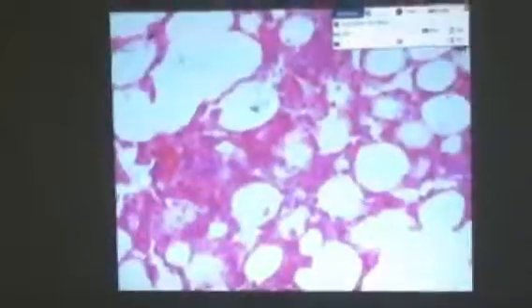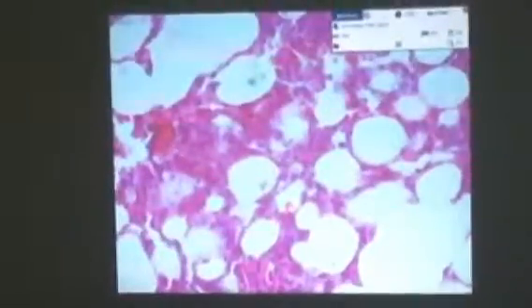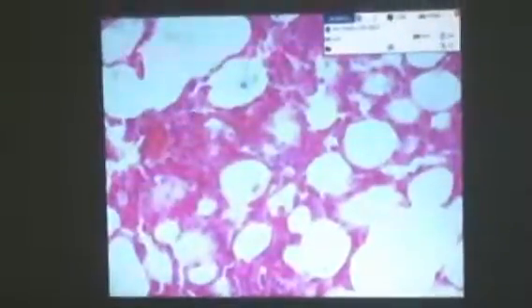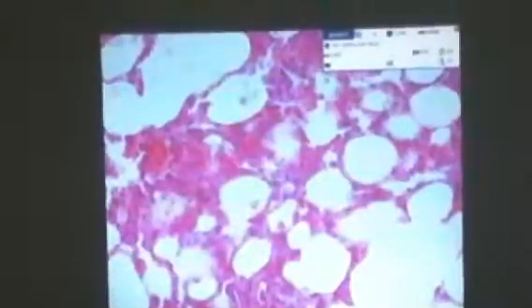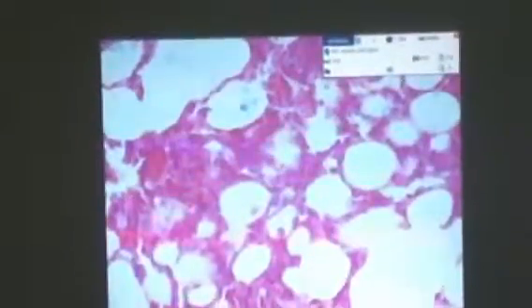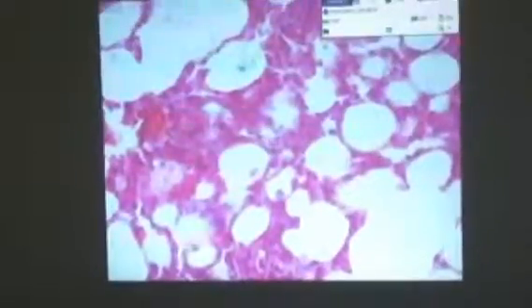So, present also inside the alveoli are those pointed cells. They are the dust cells, which are actually what type of white blood cell? Macrophage. Dust cells. What type of WBC? Isn't it macrophage? Macrophage. So, they are actually more commonly called the alveolar macrophages or dust cells.